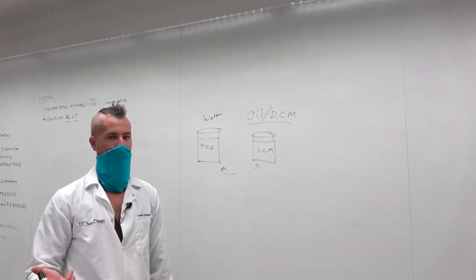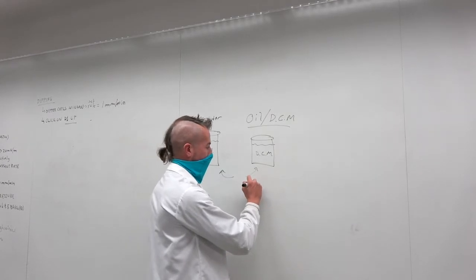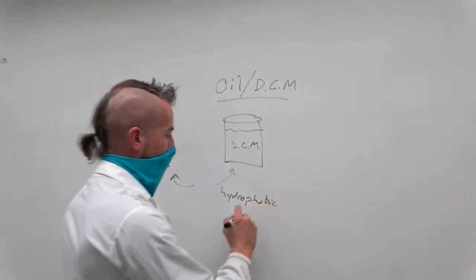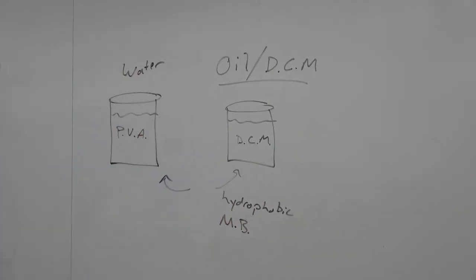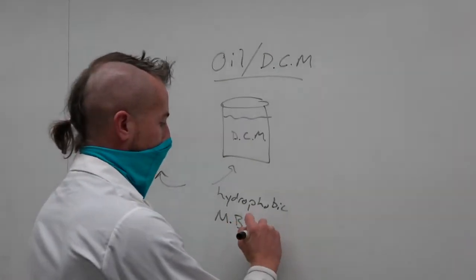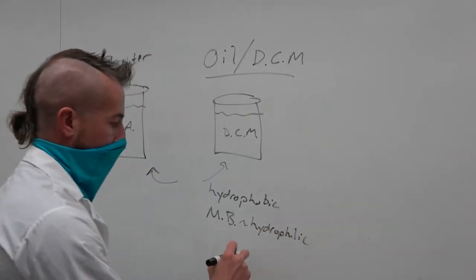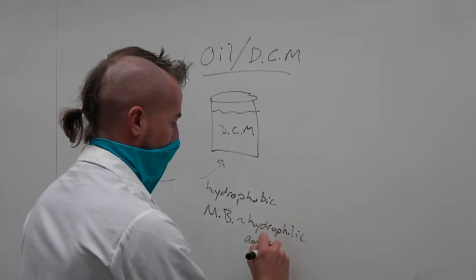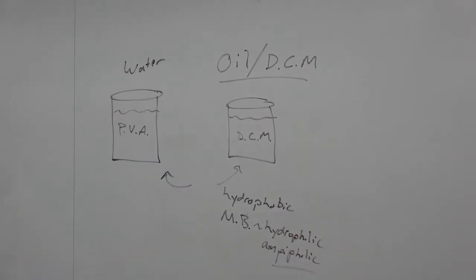And in fact, this is frequently used with very hydrophobic materials. We're using today as a model drug methylene blue, which is relatively hydrophilic, but it's actually amphiphilic. It goes both ways.